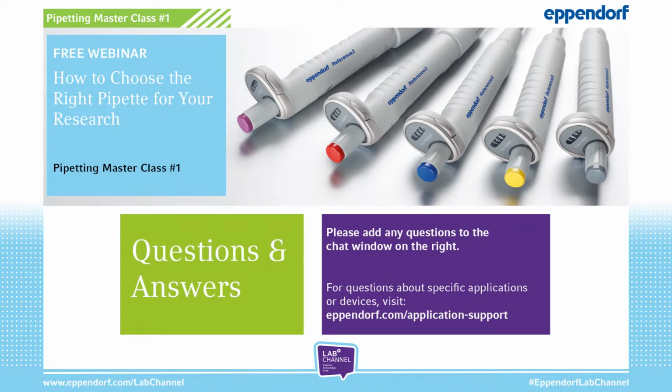Of course, air cushion pipettes also lead to reproducible results, but in some cases, and here it's meant with challenging liquids, you need to use certain pipetting techniques and consider the temporary adjustment.